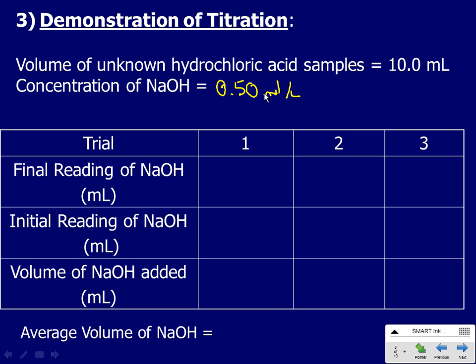So Erlenmeyer flask in position. I draw up the liquid. I'm going to draw it up past the graduation mark, which is right there. Keep drawing. Look at that. This pump is too small. So I've got to actually bring it down. I'll make sure we get larger pipette pumps. This is actually a 5 mil pipette pump.